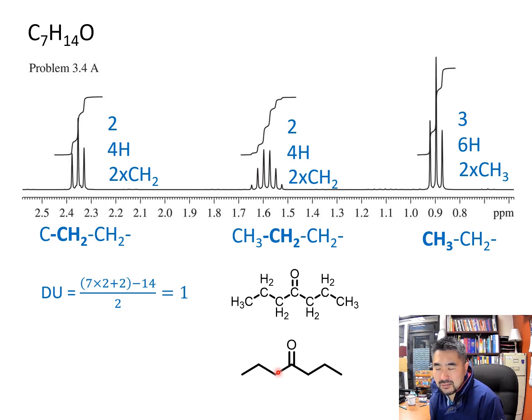For those of you who haven't taken OChem since we've obtained a new high-res NMR, 400 megahertz, you might want to make sure that you get some help from me in figuring out how to use the NMR machine. I'll post the relevant pre-lab videos from the OChem class so that you can watch them and know how to use them. I'll also share the write-up from the OChem lab manual, so you can know the very basics of how to operate the NMR, at least to do simple experiments like 1D proton and 1D carbon. Anything more advanced than that, we'll go over during our pre-lab lectures in our class here. So, okay.